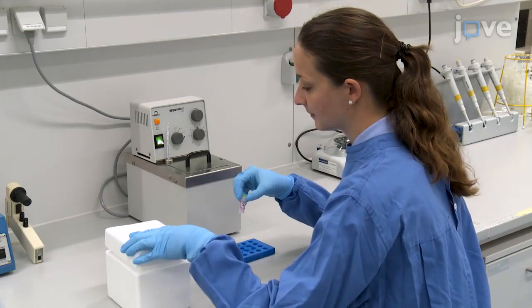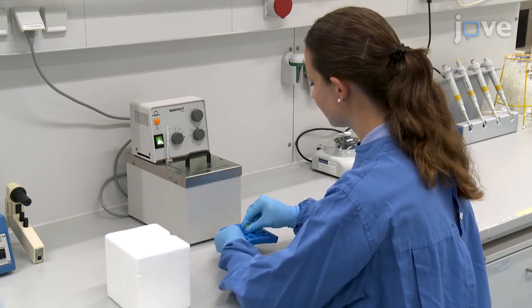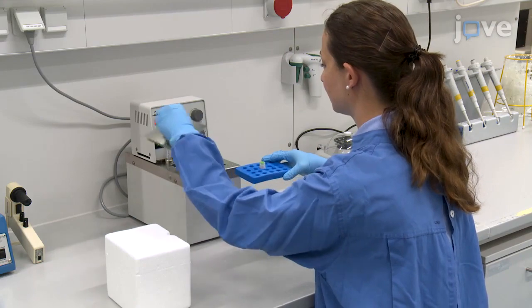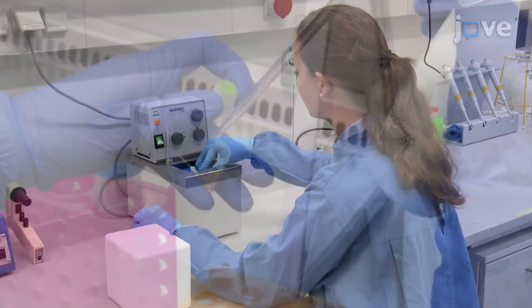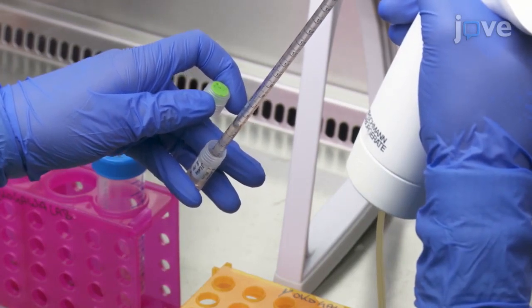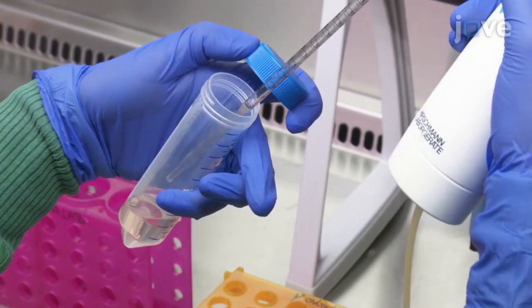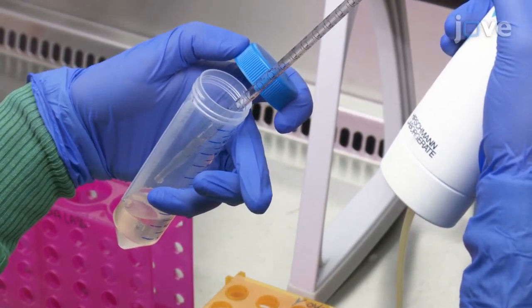To begin with, thaw the cryopreserved cardiac fibroblasts in a water bath at 37 degrees Celsius for approximately 2 minutes until the vial is left with only a small amount of ice. Next, transfer the cell suspension dropwise using a 2-milliliter serological pipette into an appropriate sterile centrifuge tube containing 10 milliliters of fibroblast growth medium.